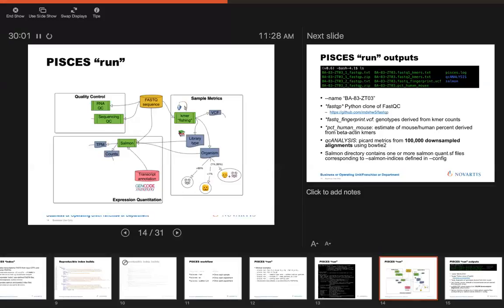That being said, we do use SNP calls on a routine basis, and the previous Cufflinks-based pipeline that we have, we still use that for SNP calling genome-wide, right, for every sample. And that's always a concern, that you have allelic bias.